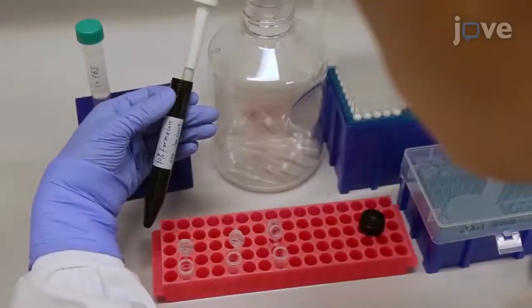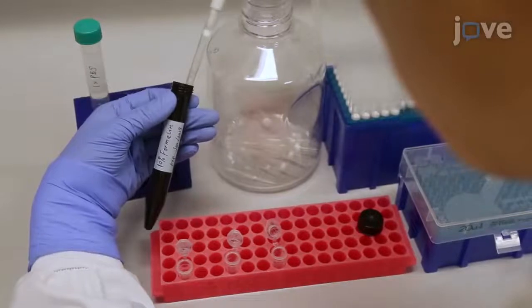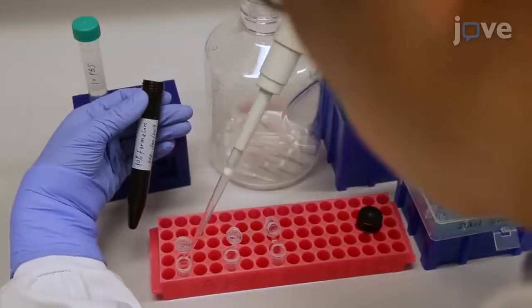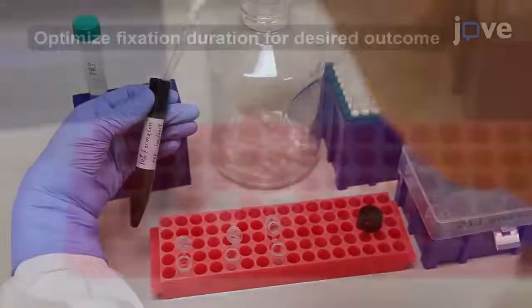Next, add 500 microliters of either 10% formalin solution or 4% freshly made paraformaldehyde. Let the sample fix at room temperature for 30 minutes.